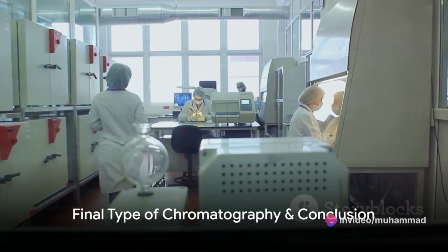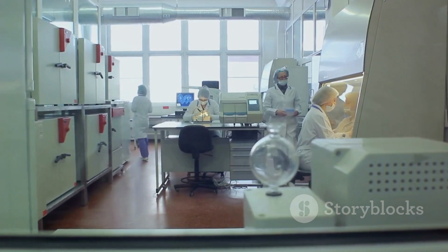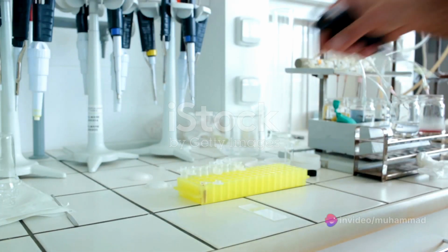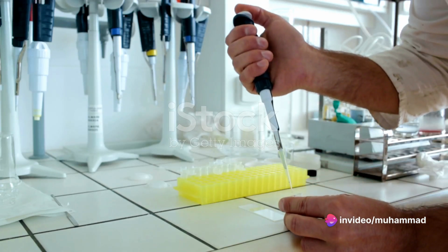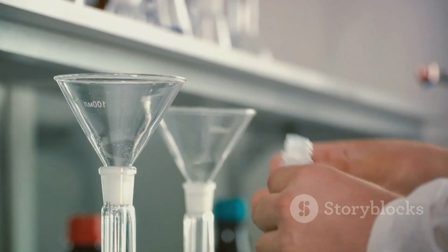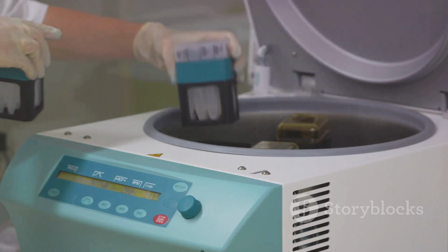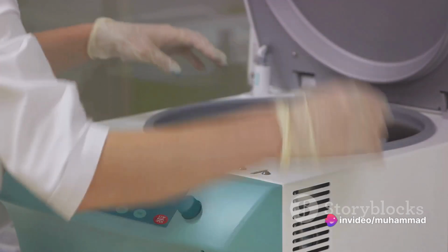Last but not least, we have a type of chromatography that's a little different. Let's dive into the intriguing world of column chromatography. This technique uses a column filled with a stationary phase onto which the sample is loaded. The mobile phase, or eluent, is then passed through the column, carrying the components of the mixture with it. The different components separate based on their relative affinities for the stationary phase and the mobile phase.